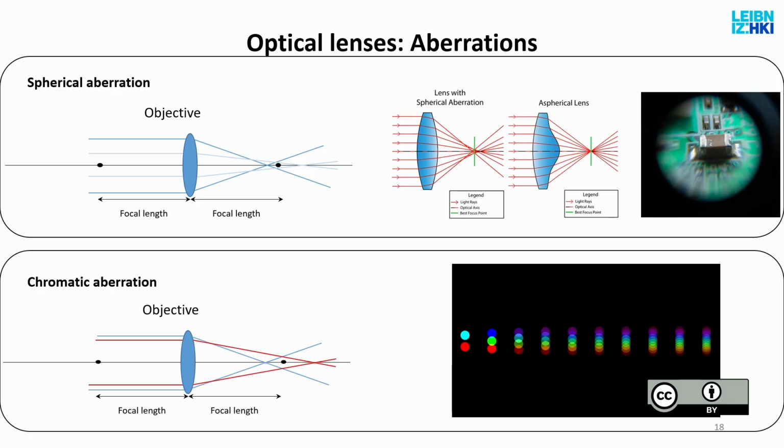This simply means that if you imagine that your lens is now of limited, finite thickness, not infinitely thin, then the refraction of a light beam which comes closer to the optical axis versus those which are farther from the optical axis will not be focused at the same point. They cannot be.